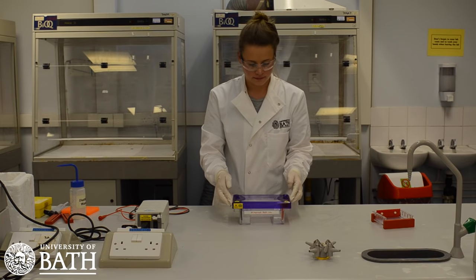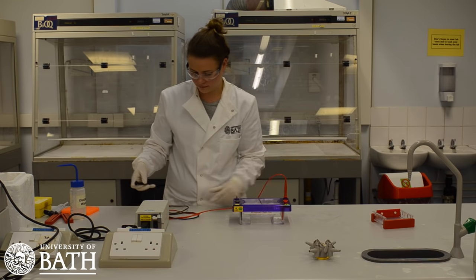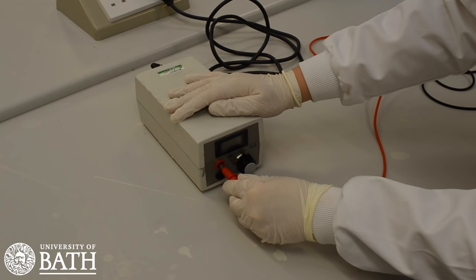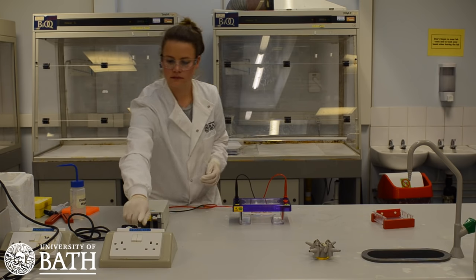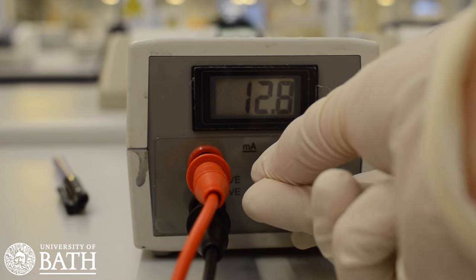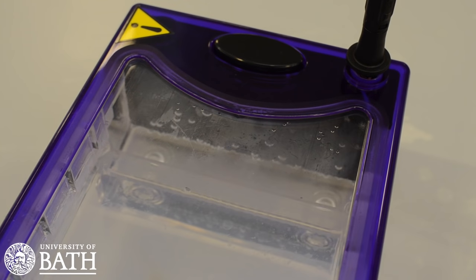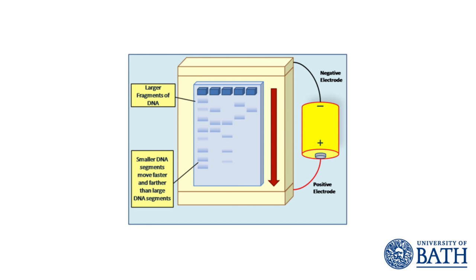When every DNA sample has been added, place the lid on the gel box and attach the leads to the power supply. The lid will only attach to the base in one orientation: red to red and black to black. Set the power supply to 100 volts and let the electrophoresis run for 30 minutes. You should see bubbles moving inside the gel box as a result of the current being passed through. During the electrophoresis process, your DNA samples will separate along the agarose gel based on their size. Shorter strands of DNA will move along the gel more than the longer ones, resulting in different amounts of separation for different samples of DNA.